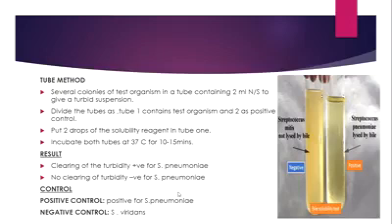In the test organism tube, we put 2 drops of the solubility reagent, and we don't add anything in the control tube. Then we incubate both tubes at 37 degrees Celsius for 10 to 15 minutes. After that, we look for the results.